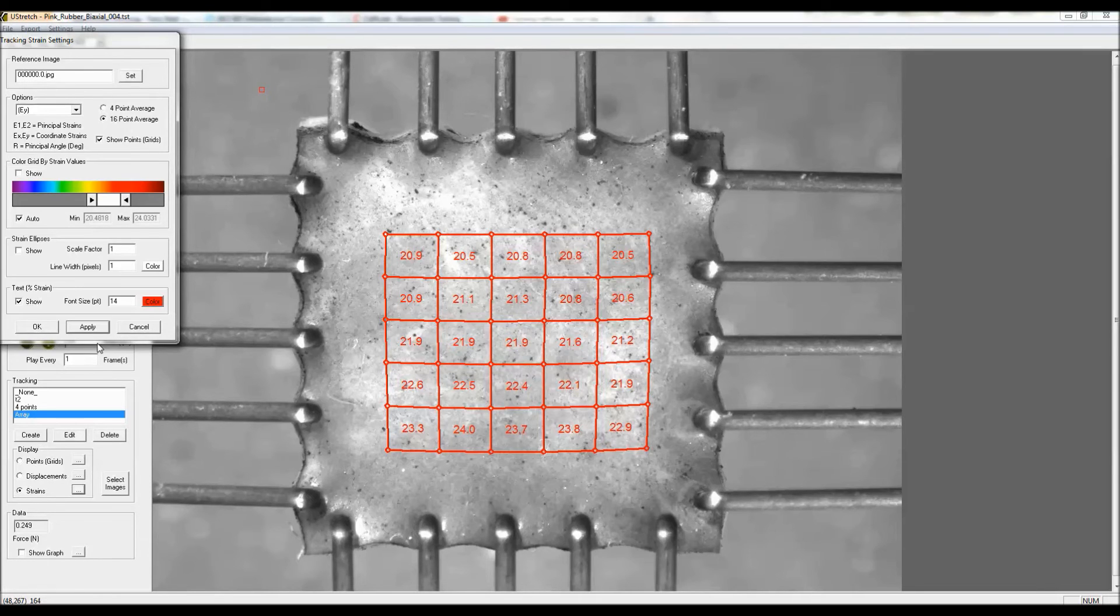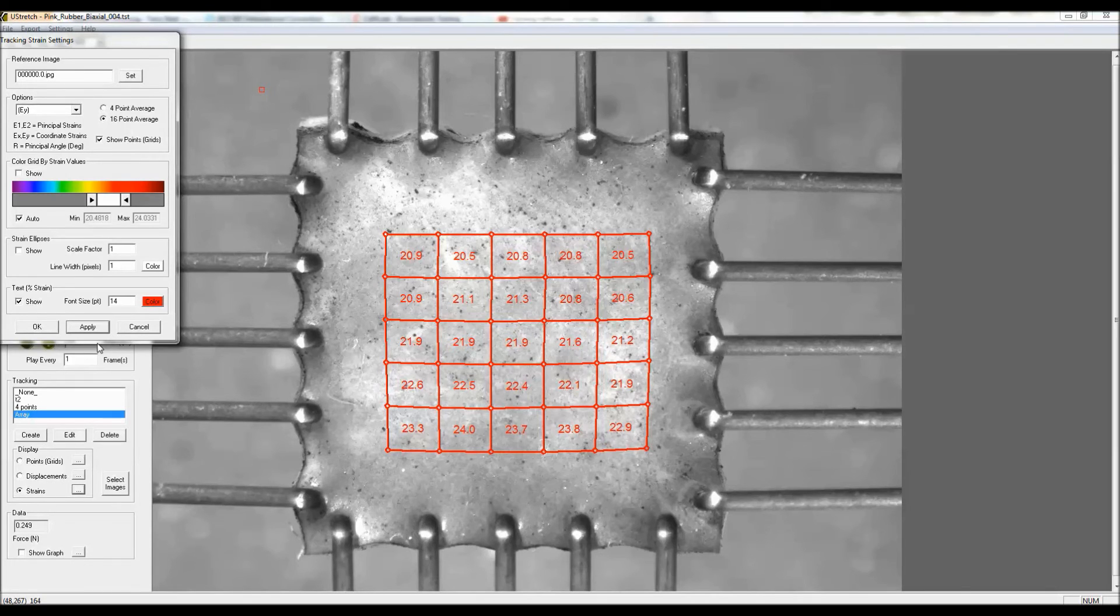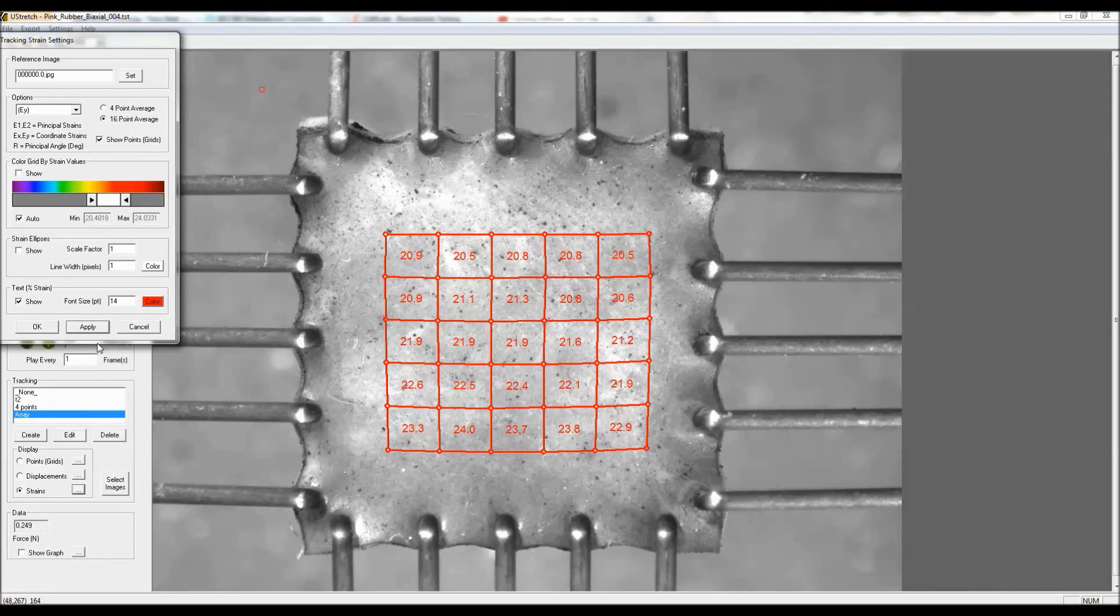Sometimes these values aren't really the same, and that can be because of local failure where the grips are attaching to the specimen. They could be tearing or pulling of those points.